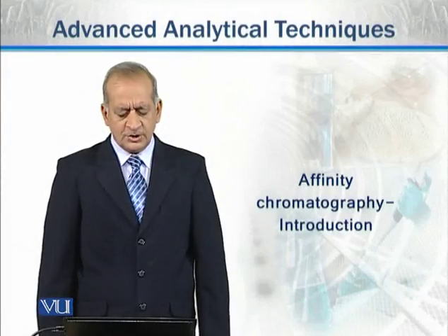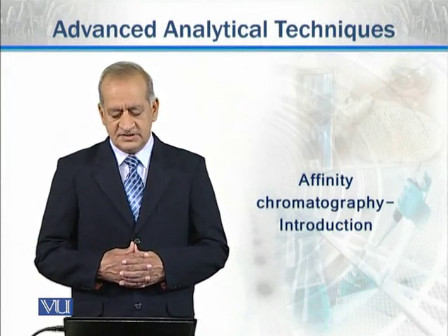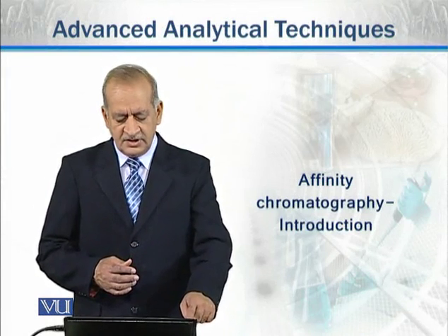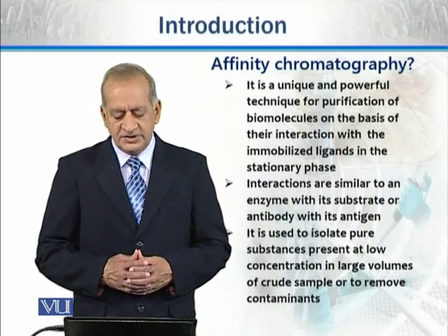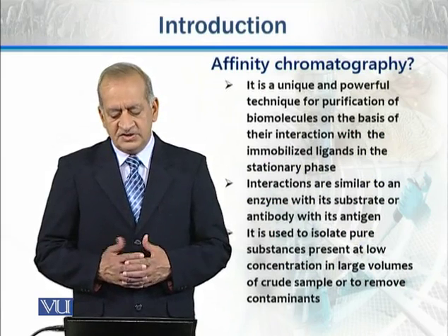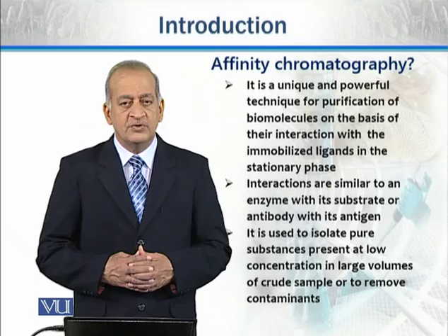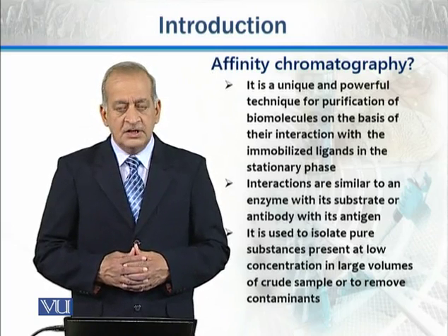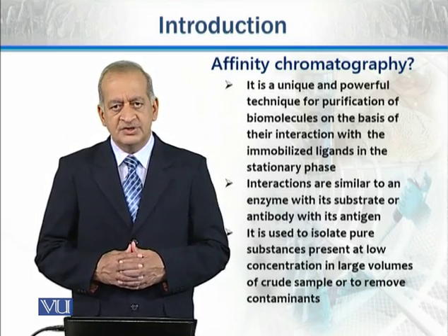So हमारा आज का टॉपिक affinity chromatography, and first of all we will discuss its introduction. Affinity chromatography is a unique and powerful technique which is used for purification of different biomolecules on the basis of their interactions with some immobilized ligands in the stationary phase.